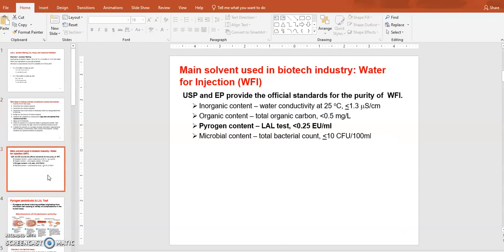And then the second exercise, which will take a long time. It may take about 1 hour incubation, and then before that you will have to mix up a bunch of different things. So about 1.5 or 2 hours will take for you to complete this second exercise. So it'll be wise for you to start out with this exercise first, and during the incubation time you can get to do the other exercise.